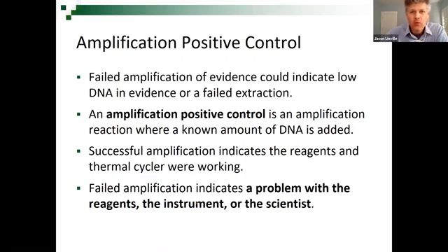The reason for an amplification positive is that we don't want a mystery surrounding whether it was the amplification, the extraction, or the evidence that did not contain DNA. We want to run a sample where we know we take DNA out of the freezer. It's not an evidence extraction that should have DNA in it. It's not even a known sample that we extracted from a person. It's a tube that says DNA control on it. We buy it from the company. The sample is certified, and we are confident that there's DNA in that tube.